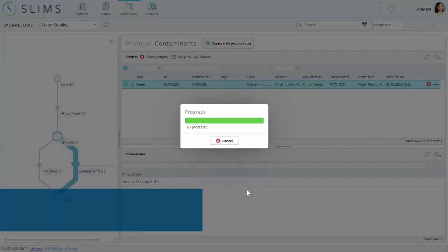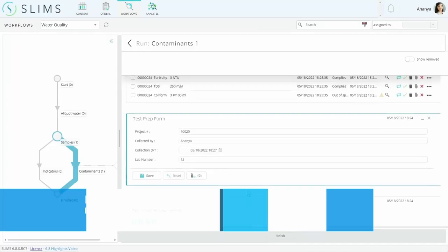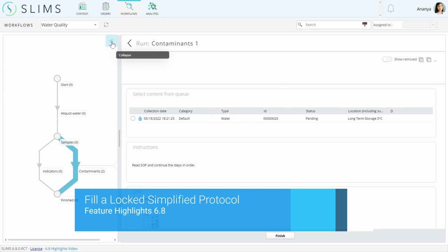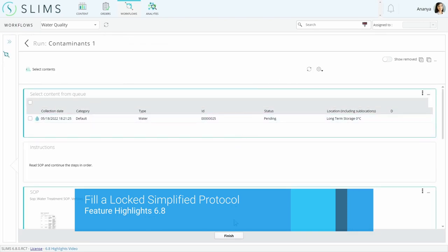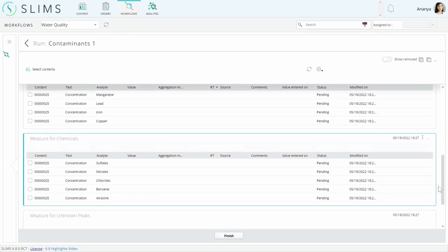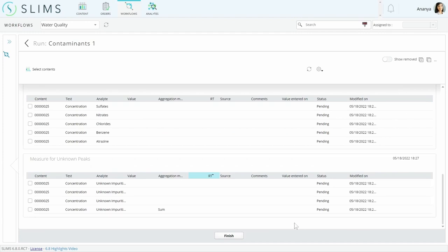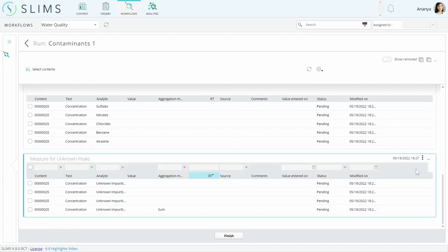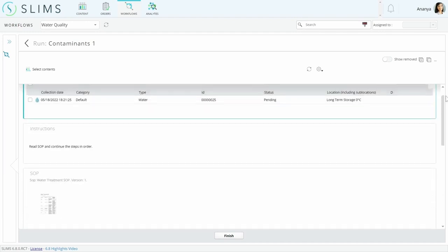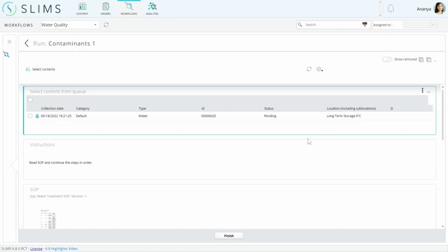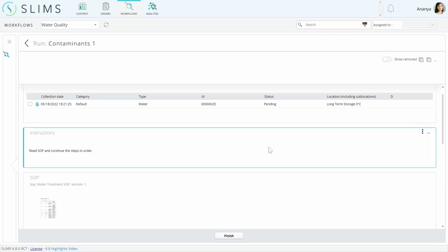The contaminants protocol is locked by comparison to the indicators protocol. We want the user to go through the run from top to bottom, so it isn't possible to add, rename, copy, or drag blocks around. The blocks also cannot be removed due to a restriction at the block level. This note block has also been made read-only to provide instructions.